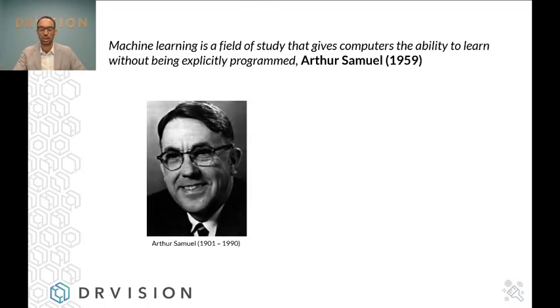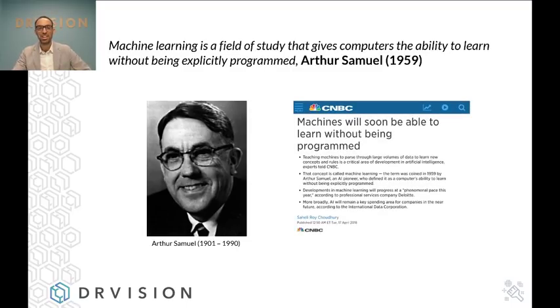That's of course very attractive. That's Arthur Samuel. The interesting thing is, even though we've made huge advances in many areas, and machine learning is being used in a wide range of fields from finance to medicine, it's not yet fulfilled this desire to get the machine to learn for itself. It hasn't come to fruition yet completely.